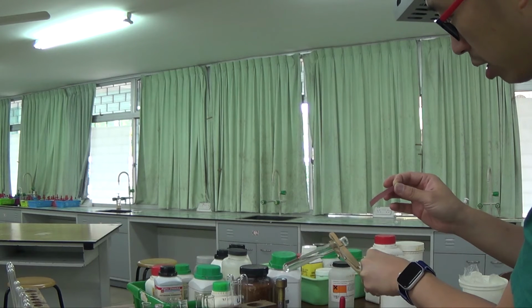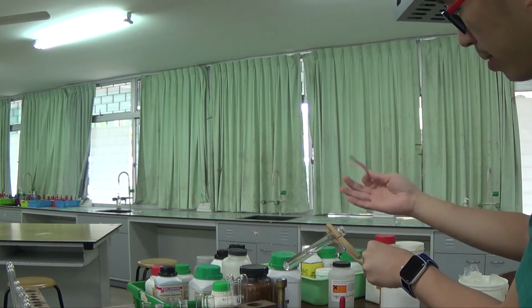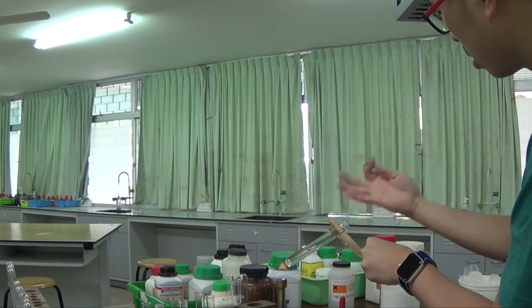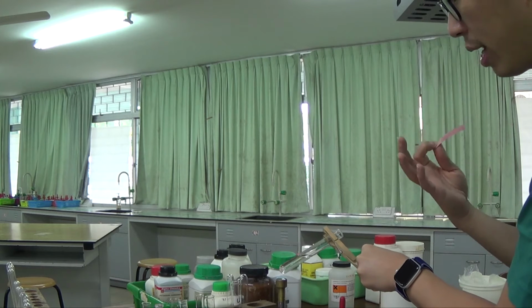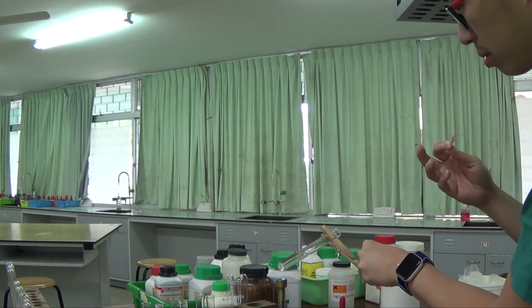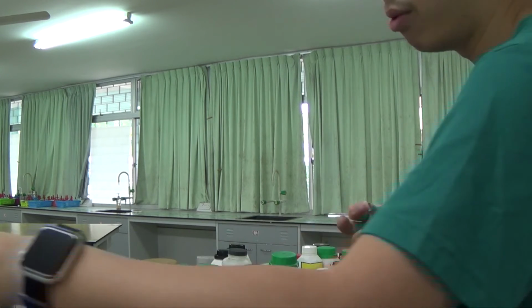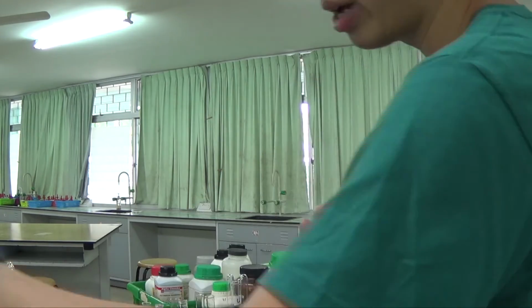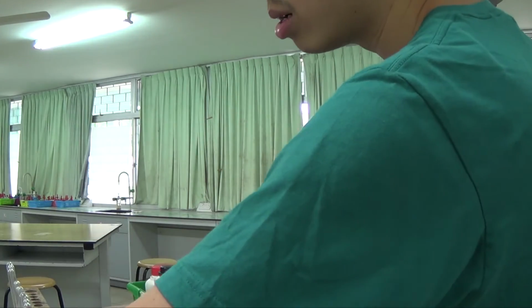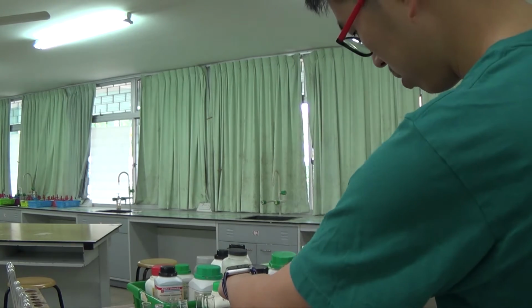So I will try and heat this. And then usually you'll be able to smell, if you can smell a pungent gas, P-U-N-G-E-N-T, coming out. This is a lot of solution to heat actually, so that's why it's taking so long. I will remove some bit of solution so that I am not heating that much, so that it won't take that long. Perhaps I need a bit of stronger fire.